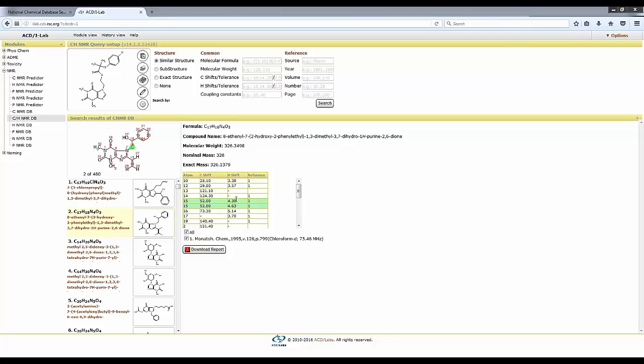That's mostly what I intended to present to you today. If you have questions, you should type them in the question box right now, and we will answer them as they appear. Okay, I see one question appearing. What is the maximum molecule size we can have? So what is the biggest molecule we can enter?